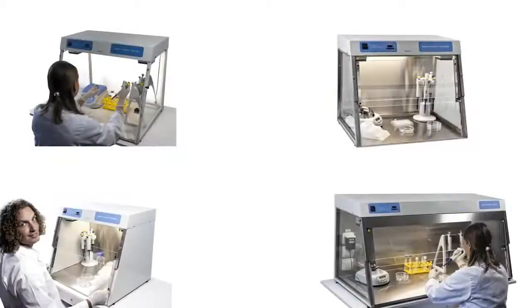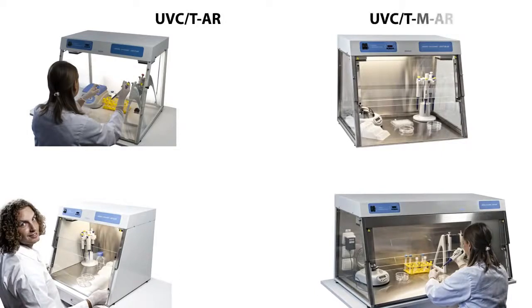Bison presents four UV Cabinets for PCR operations: UVCT-AR, UVCT-MAR, UVT-BAR, and UVT-SAR.